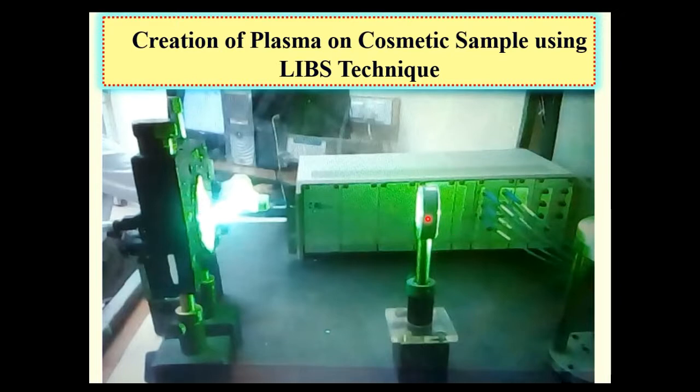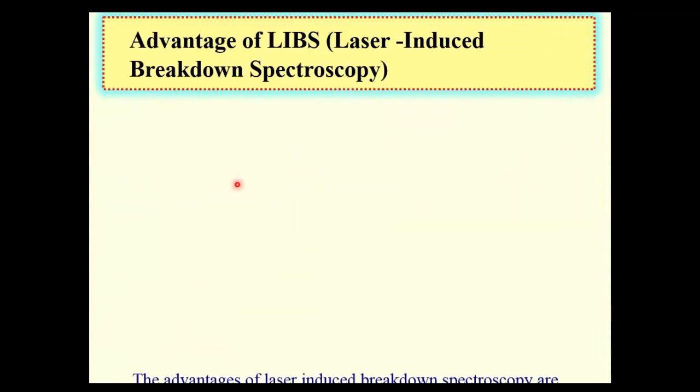this is a convex lens, and from this side our laser comes and interacts with this target material after passing through this convex or focusing lens. As a result, plasma is generated. Due to recombination, the plasma emits radiation, and these radiations are collected by the spectrometer through an optical cable. From this side, our optical cables are present which absorb the radiations.